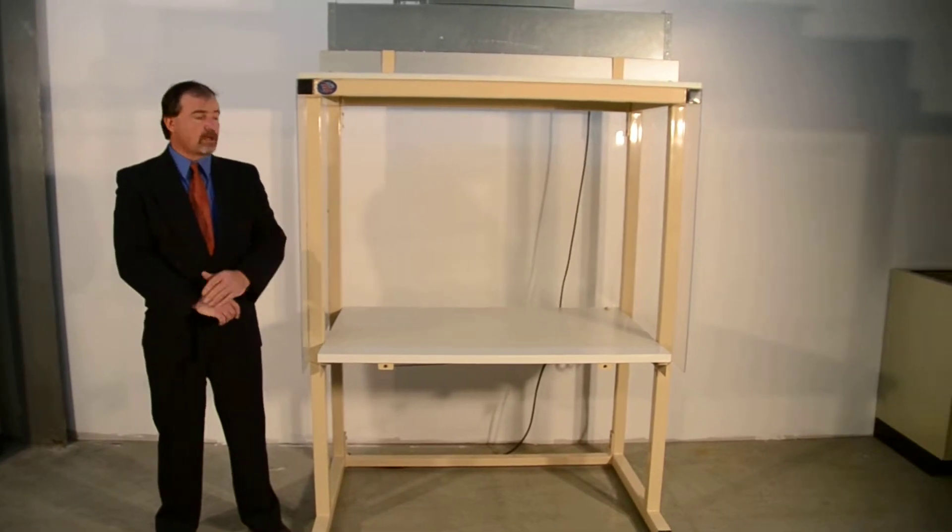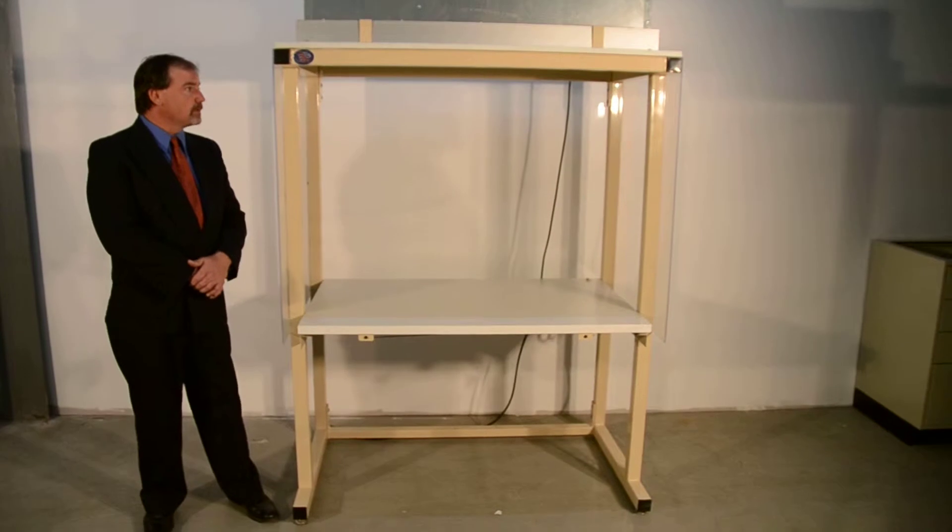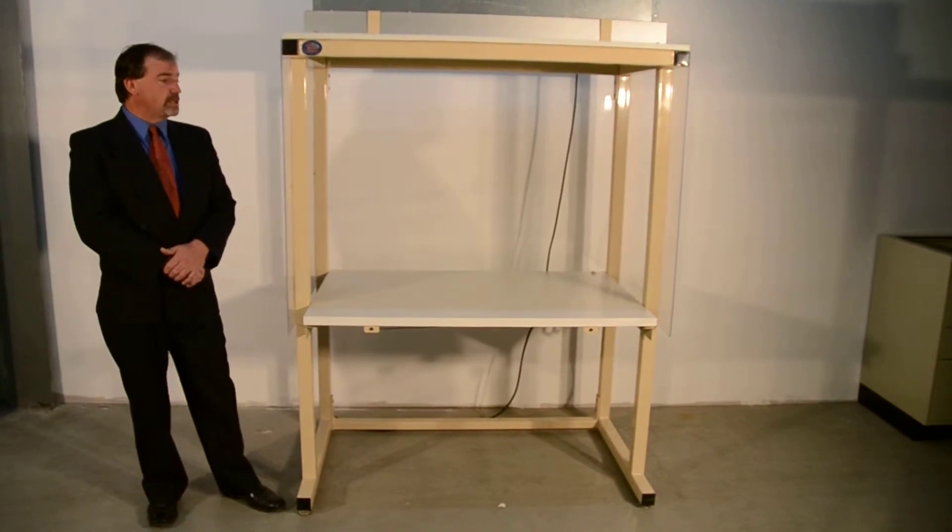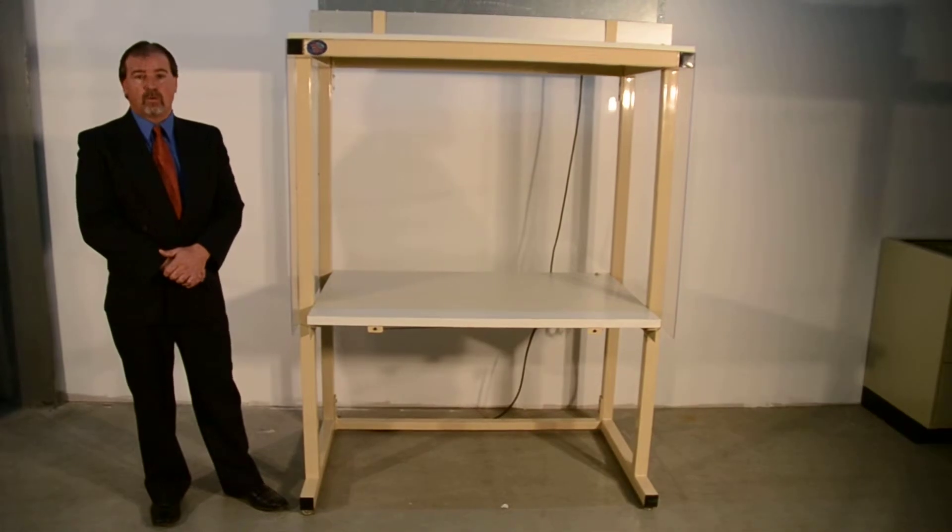Today, I'm going to be talking about our model CR Clean Room Series Workbench. What we have here is a Class 100 laminate flow workstation.